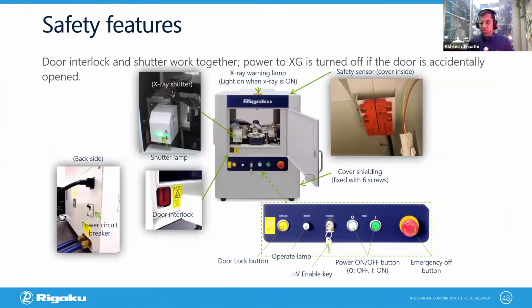So we talked about, in short today, the 3 key features: some basic idea why we see peaks, how to prepare a sample to the level of collecting data, and what the different applications are. But of course, when it comes to X-rays, everybody has some sort of worry about whether everything is safe.